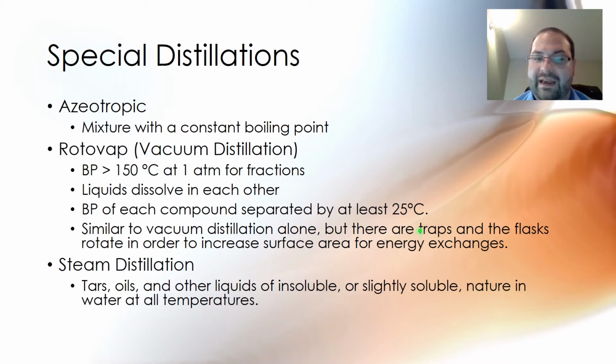And the rotation is important because what that does is it allows the solvent to go over a wider surface area on the flask, and that lets more energy flux through the solvent and allows it to evaporate faster. So it's cool to see. You can probably find some videos of it on YouTube.